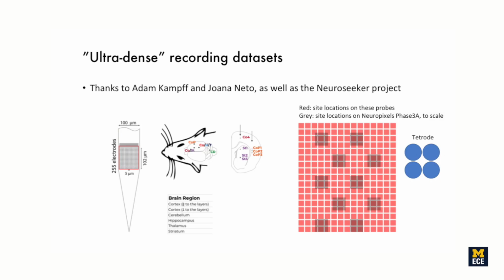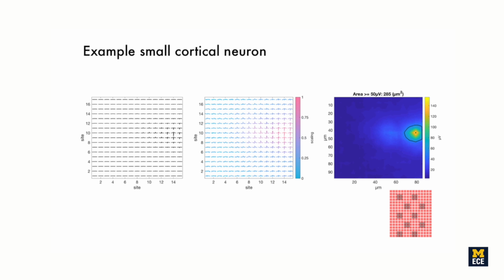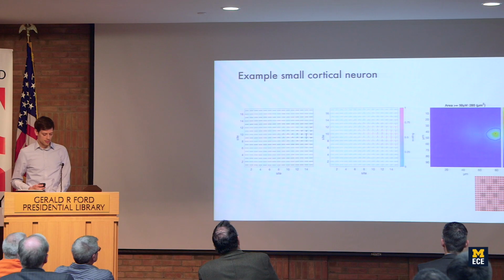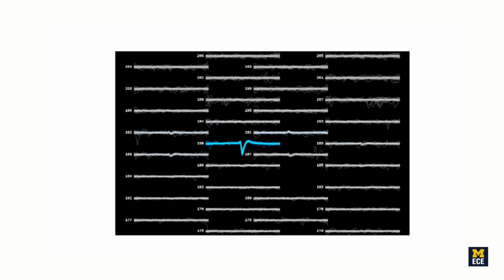So they're showing on this graphic a couple of the different recording site locations. I don't have the histology here, but you get the basic idea. They just stuck it in a few different places. So this is in neocortex. Okay, and we may have expected actually from the NeuroPixels recordings that we would see some neurons like this, because I have isolated examples where I did find such a neuron where on a NeuroPixel site, one site can see it really with large amplitude, but adjacent sites already don't see anything about that neuron. And so we might have expected that there are these neurons with really, really small electrical fields.